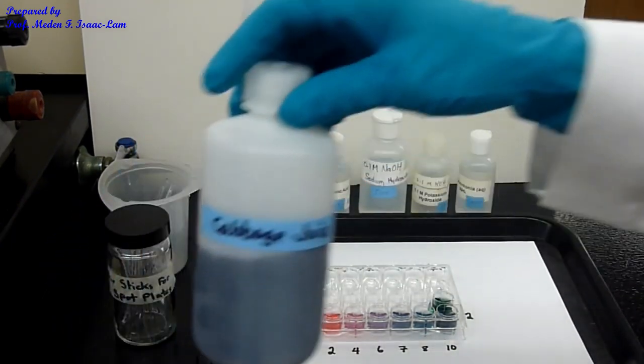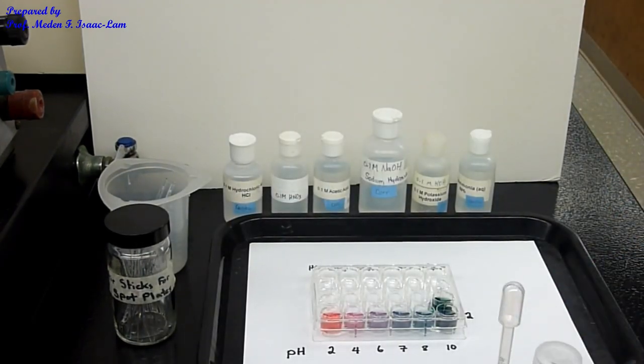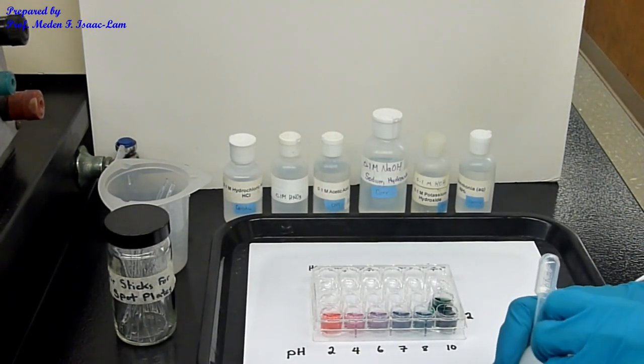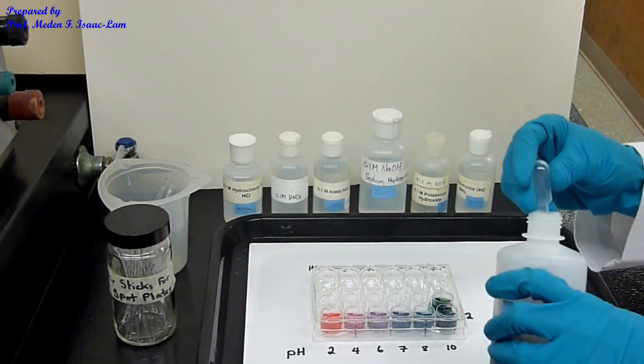Now I'm going to add the cabbage juice again. I'm going to add 20 drops in each of the solutions, and then you will note the color.